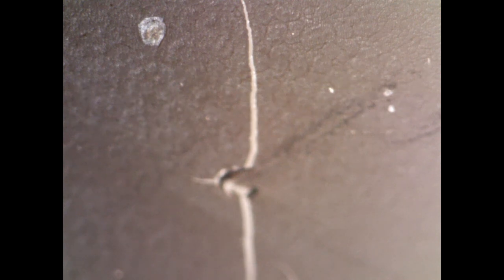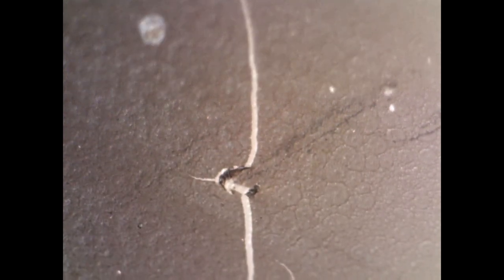We're going out into the white. You can see how the dimples just fade away. Look at that kind of painterly mark. Another larger painterly mark. It leaves this weird kind of trail. We're back into the dimples. A couple of isolated lily pads. There's one of the painterly marks. It's kind of zigzaggy, wavy. And here we go. More lily pads. There's that weird structure we saw earlier.